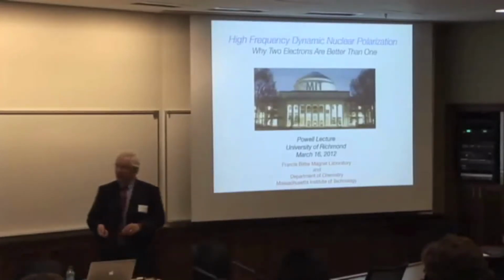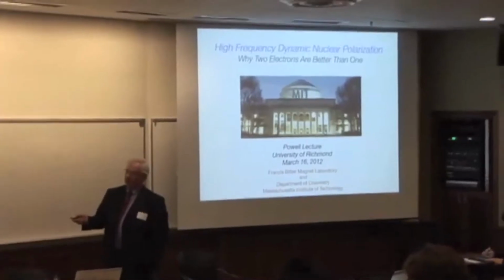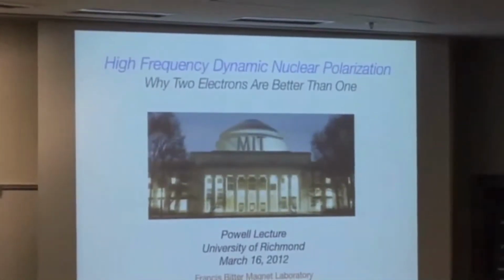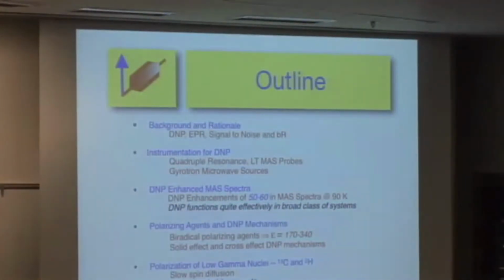Anyway. Okay, so what I'm going to tell you about is a technique, a phenomenon called dynamic nuclear polarization. The subtitle of this talk is Why Two Electrons Are Better Than One. And as we go through the talk, this will become clear. It's actually a biradical polarizing agent that gives us a much higher sensitivity than you would get normally out of this technique. So an outline of what I'll tell you is shown here.